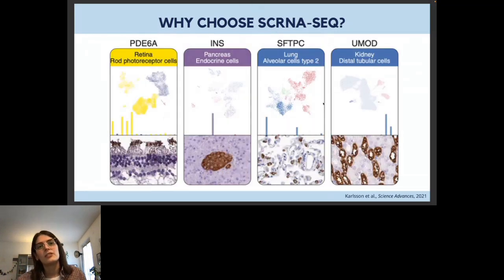I think that single cell is a very nice way of combining these things. We will see how to generate these graphs. These are UMAPs, and each dot on this graph represents a cell, so a cell with all the transcripts that are contained in it. In this nice paper, they highlighted some cell types by some markers, and they also performed immunohistochemistry. So you can have a virtual representation of cell types, and you can also see what it translates to.